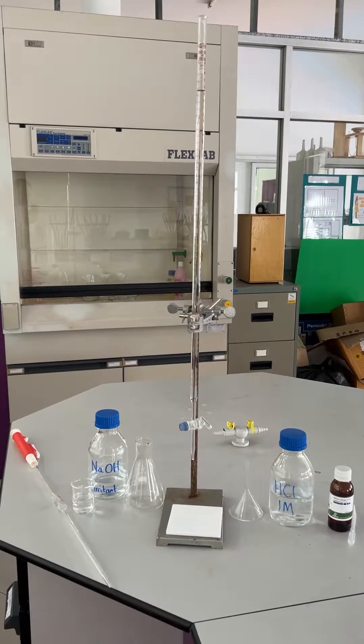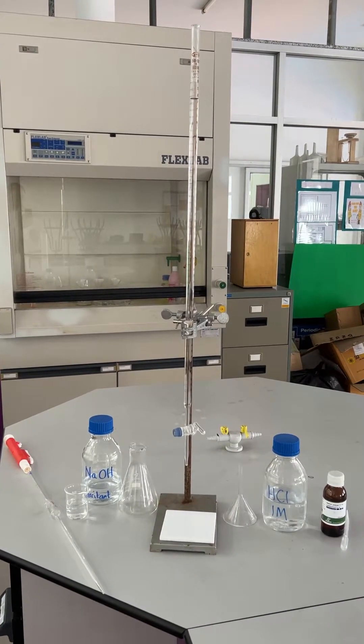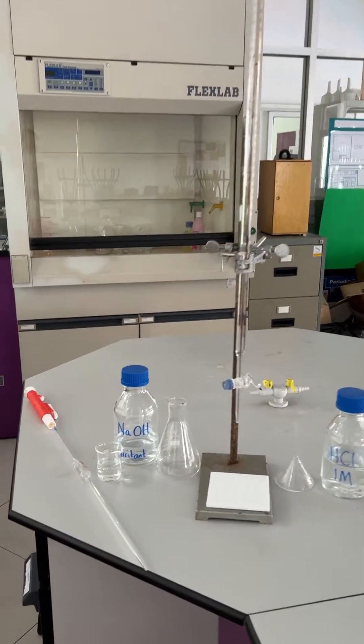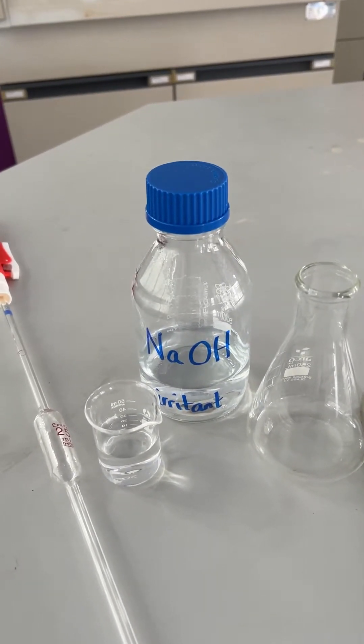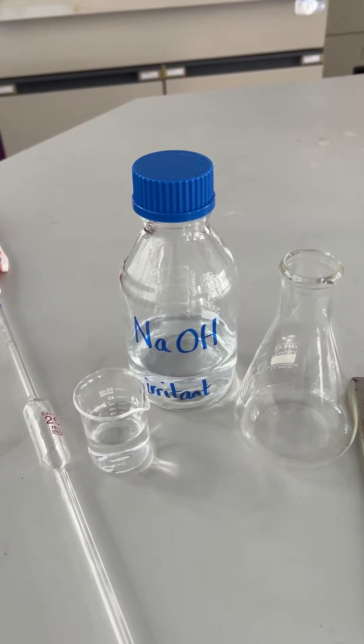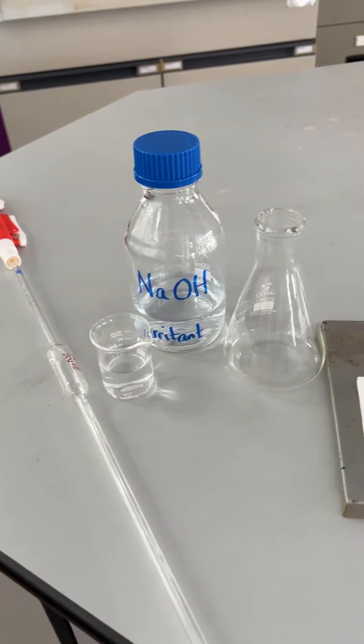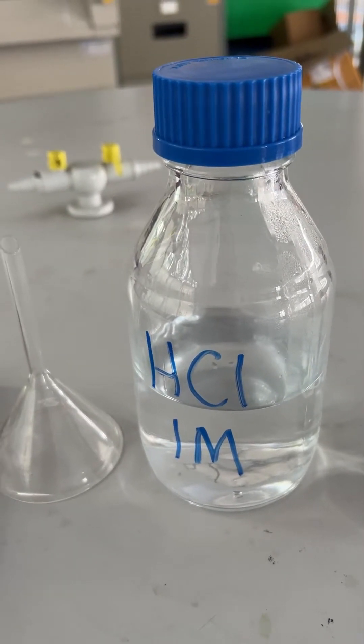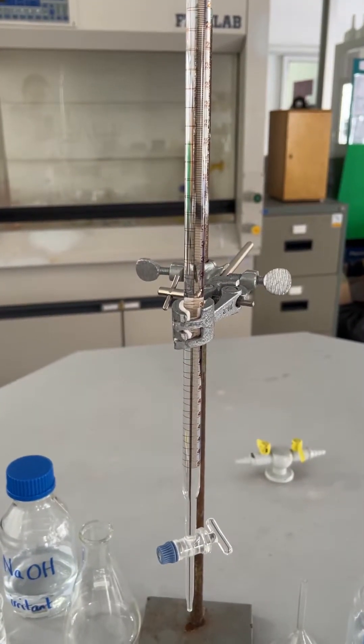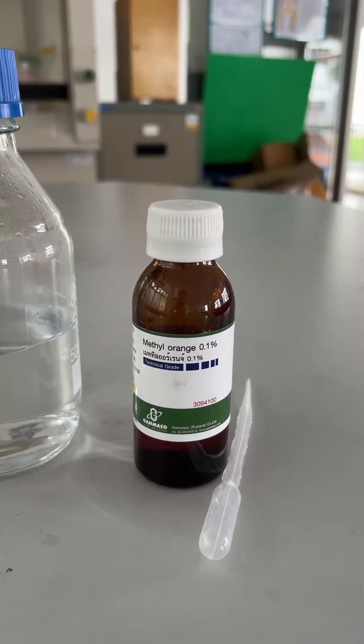In this experiment we will be titrating hydrochloric acid against sodium hydroxide. The sodium hydroxide, 25 cubic centimeters, will be measured using the volumetric pipette. The hydrochloric acid is one molar and will be placed in the burette. We'll be using a methyl orange indicator.